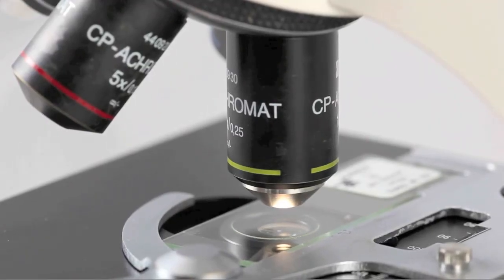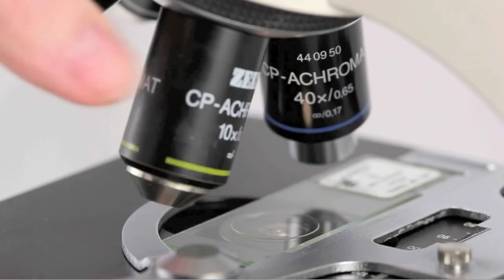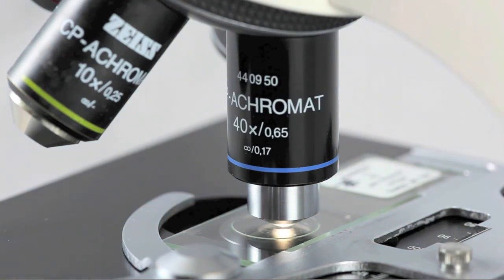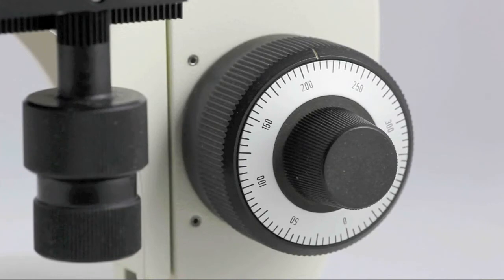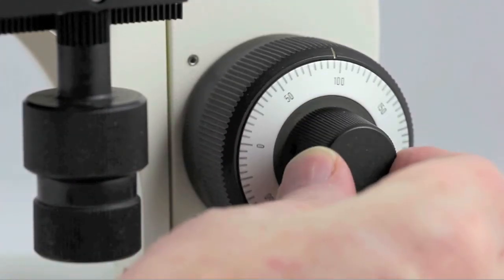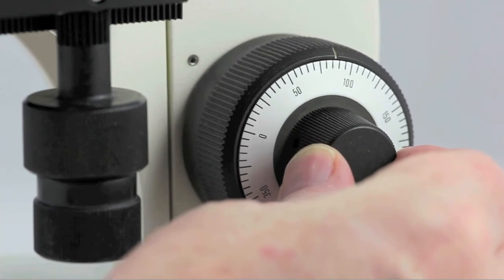Once you have centered and focused the object perfectly with the low-power objective, you can move on to the high-power objective. Notice how close this is to the slide. You must only focus with the high-power objective using the fine focusing knob, so that it does not break the slide.